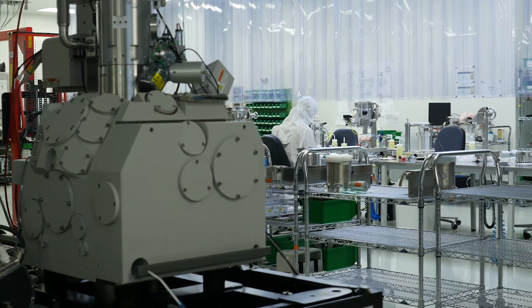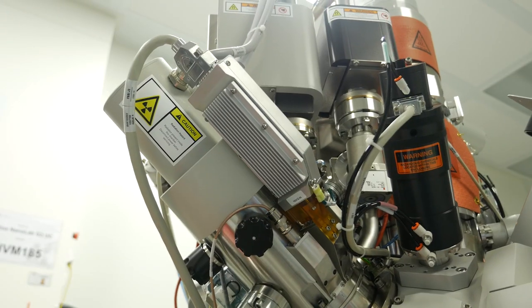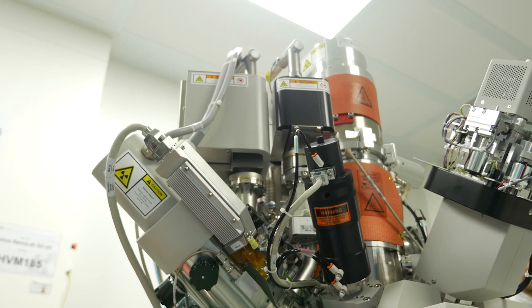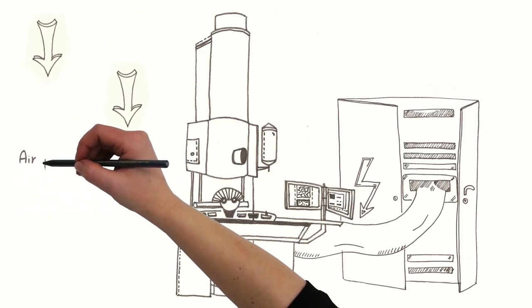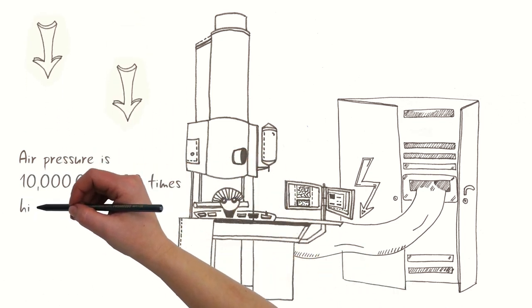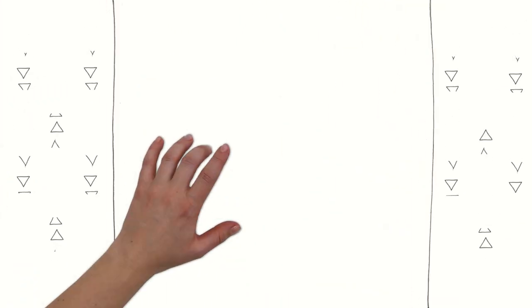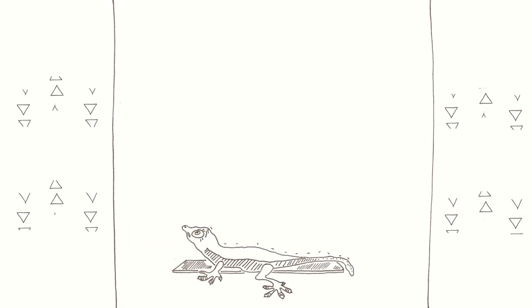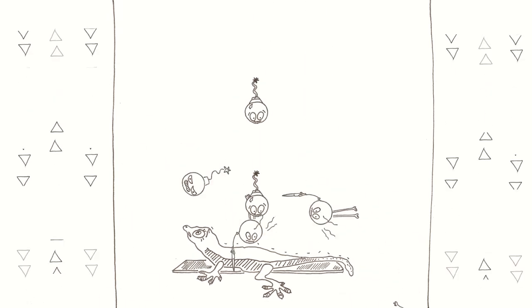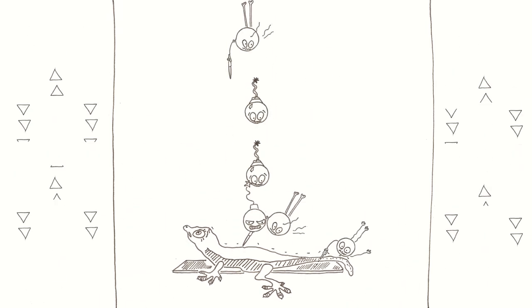Let's go on. Since electrons move freely only in a vacuum, there must be a vacuum in the entire column. To achieve this, vacuum pumps are used. Various levels of vacuum are needed. The highest is around the electron gun. The difference between common air pressure and residual pressure in the microscope is about 10 orders of magnitude. So it means that the probability that an electron will hit an air molecule under this pressure when passing through the column is zero? Yes, almost zero. However, dozens of millions to billions of electrons hit the samples per second. Poor lizard.